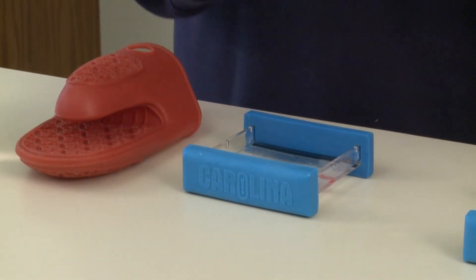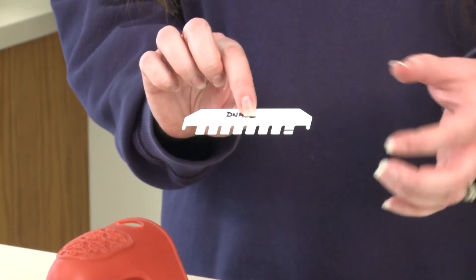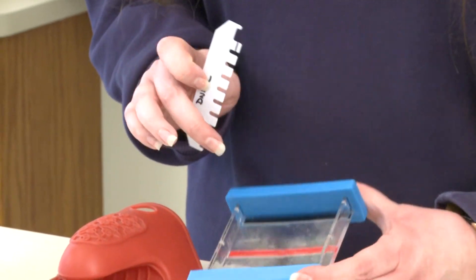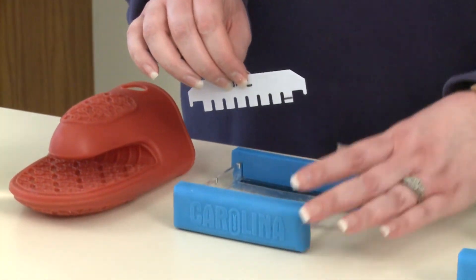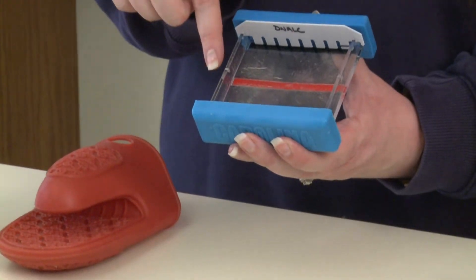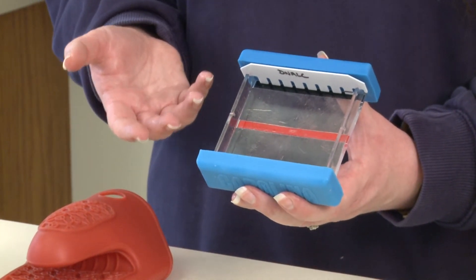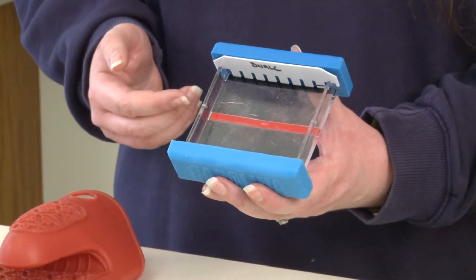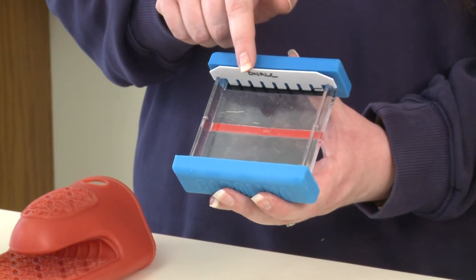Before we pour our agarose inside we need to add a comb. A comb, as you can see here, has eight teeth — although they may have different numbers of teeth — that we place inside the notches available on the casting tray. You can double comb, meaning you can place a comb in the top set of notches and the center set of notches if you don't need to run your DNA very long and you want to load more samples. Or, as we're doing today, we can single comb the gel and put one single comb up top.